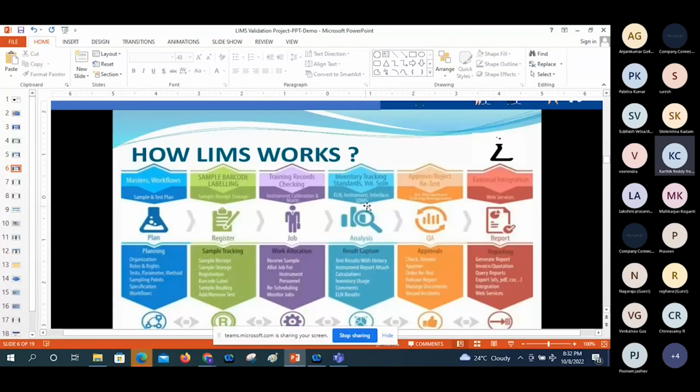So if a scientific data management system has been implemented, while doing the instrument interface, passing the data from the instrument to the LIMS is very easy. Why? Because the particular data generated from the instrument can be sent to the SDMS application. There are some fields there, and those fields we can update in the parsing scripts. If we are updating those, the data can be easily transferred through the parsing script, and the data can be passed from the file-based instrument to the LIMS application.